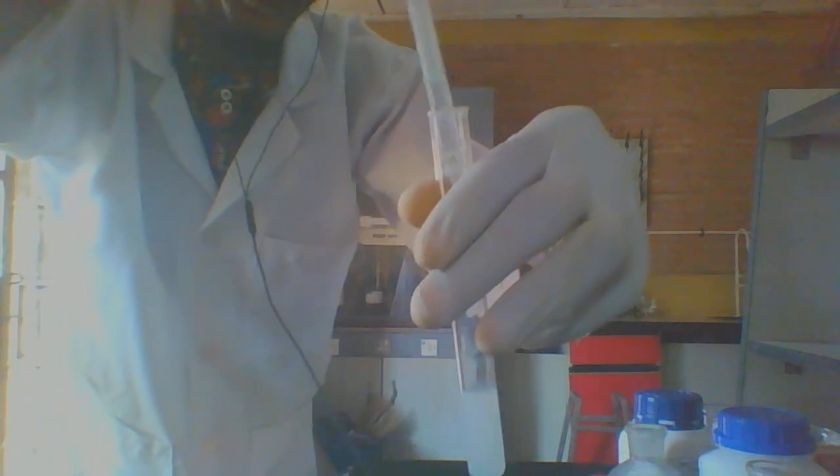With ammonia, you see a white precipitate. But this time around, it is not dissolving in excess. It is still a white chalky precipitate, which means that we have confirmed lead(II) ion.